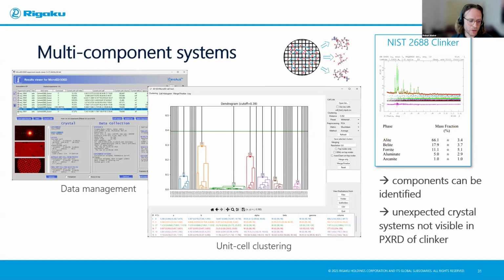We're working quite closely with OLEXsys on this to have new features in OLEX Refine. At the moment, this was more focusing on dynamic refinement, but this is certainly another thing to look into, to have a more solid statistical understanding of the data, not just in a chi-square sense. Actually, a good point, but it's only at the beginning.